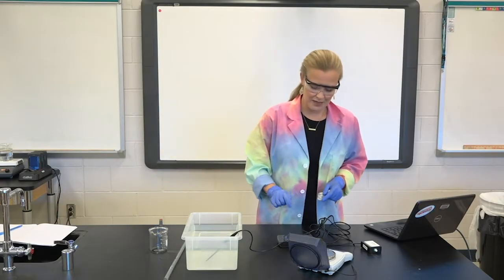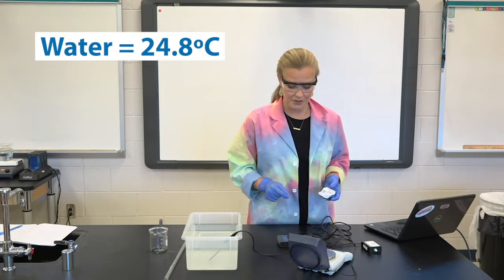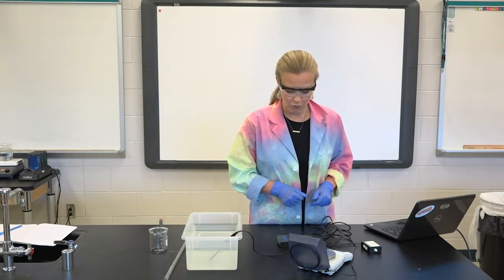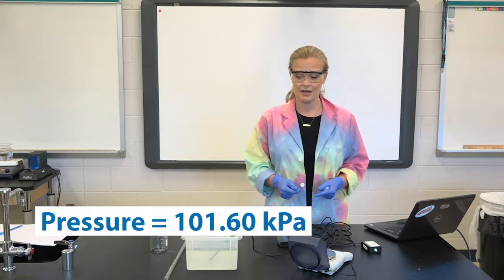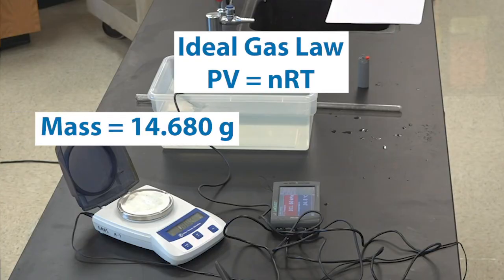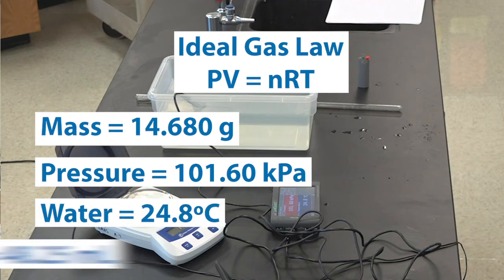The last two things we need are the electronic measurements. We've got a temperature reading of 24.8 degrees Celsius and a pressure reading in the room of 101.60 kPa, or kilopascals. Since we're going to use the ideal gas law, we've got mass — which we can deal with in terms of moles — a pressure, a temperature, and a volume.